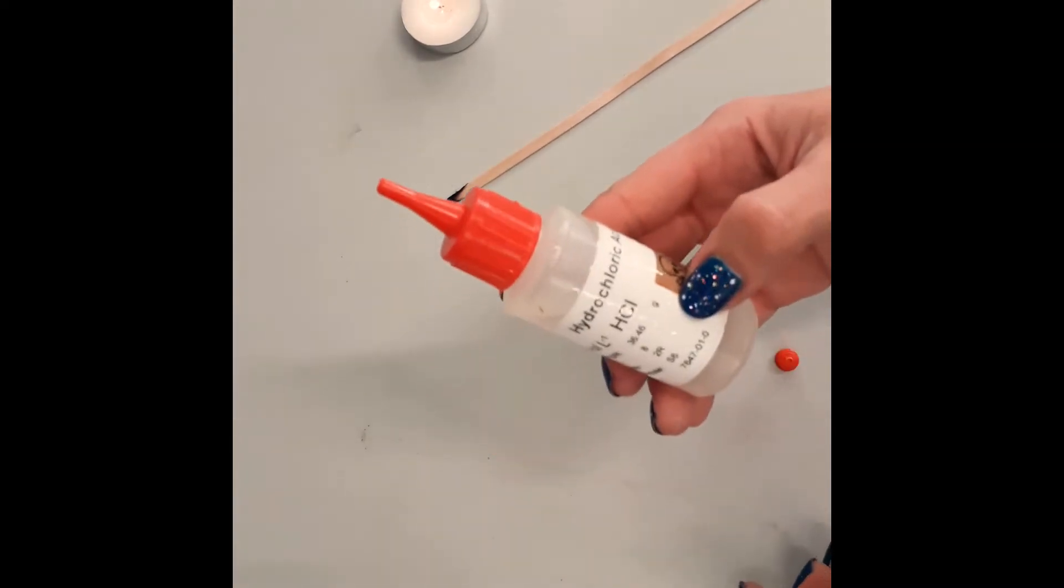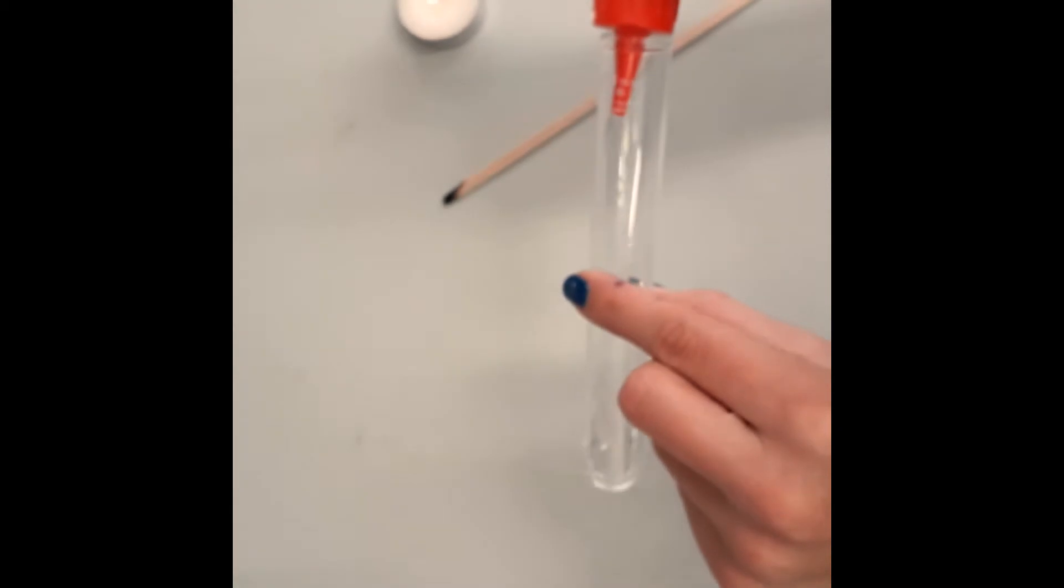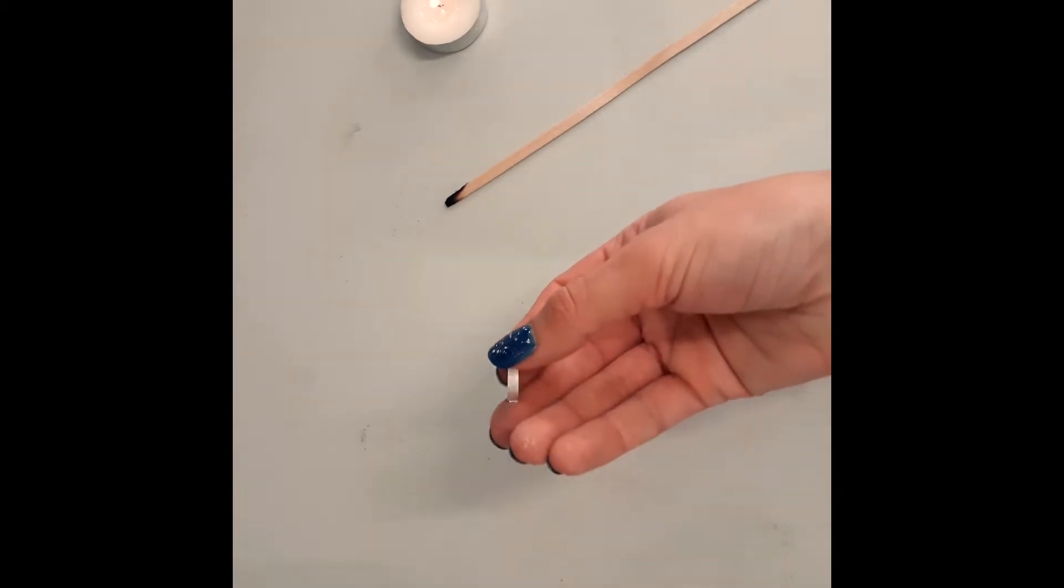Okay, so we're in the lab. I'm going to do this experiment. So I've got a test tube here and some hydrochloric acid. Pour that in about a centimeter worth at the bottom. And then we're just going to add a little strip of magnesium.